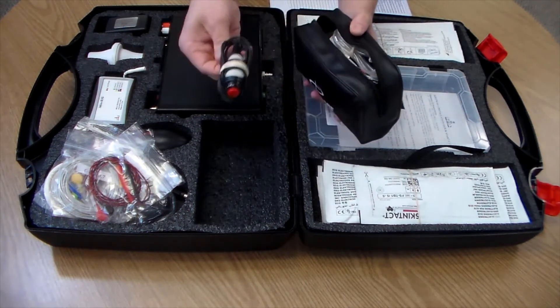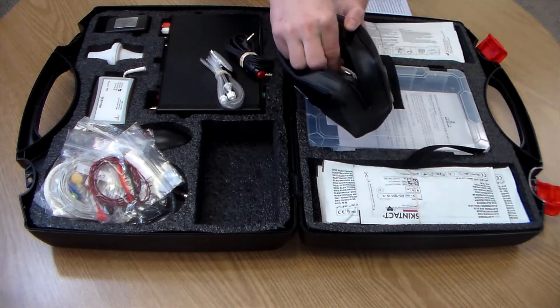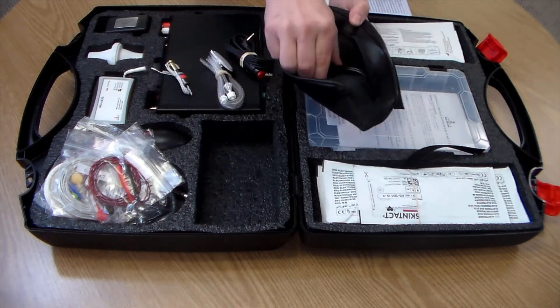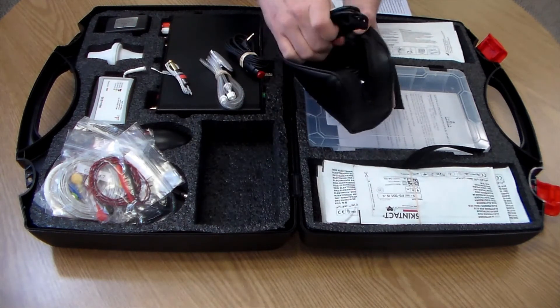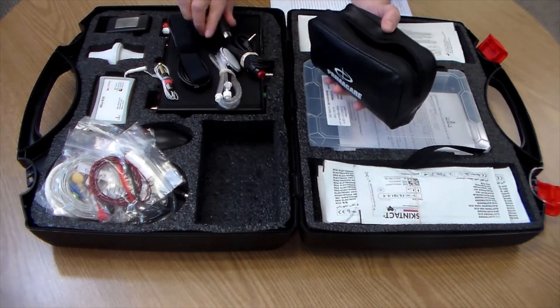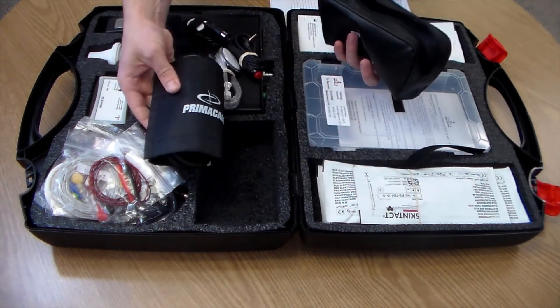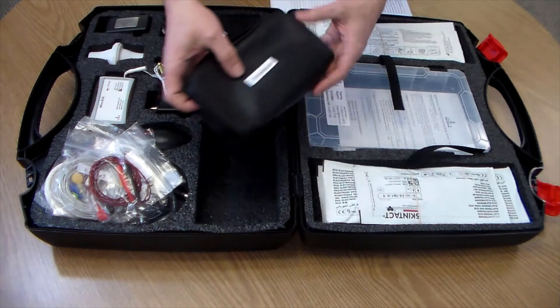The sensor pouch contains your event marker, stethoscope, temperature sensor, muscle transducer, pulse sensor, pressure sensor, and blood pressure cuff.